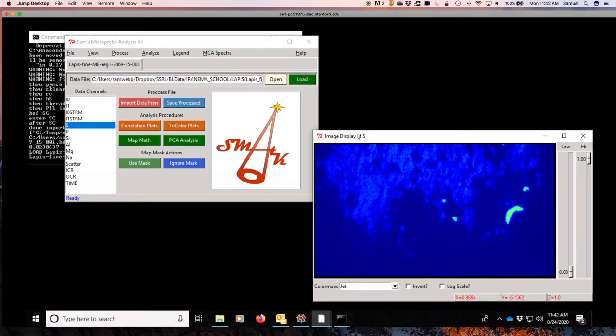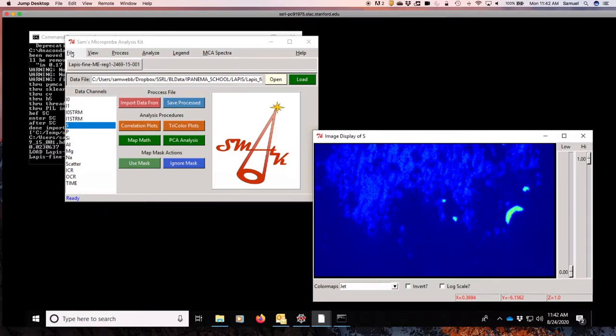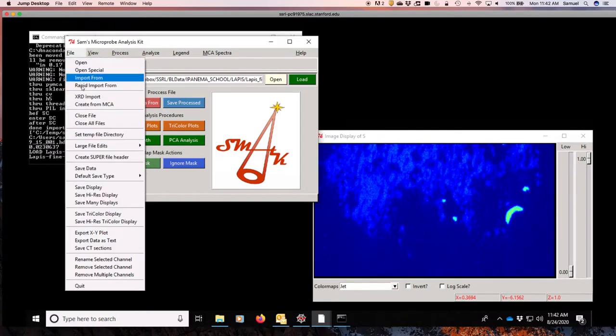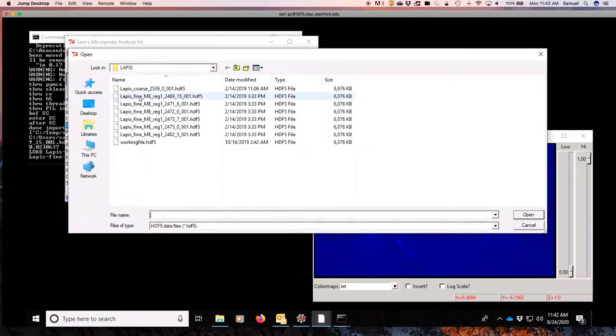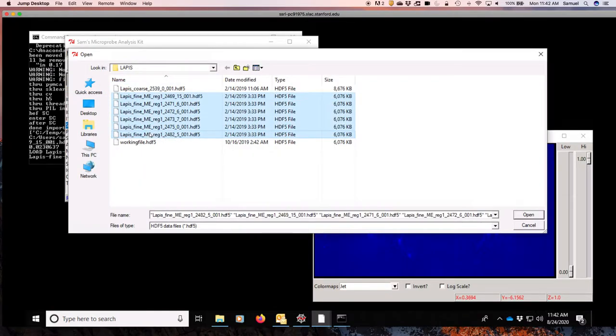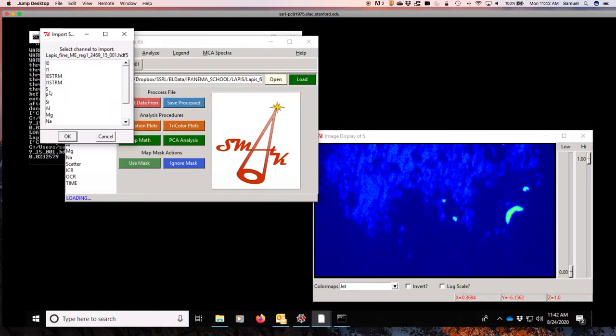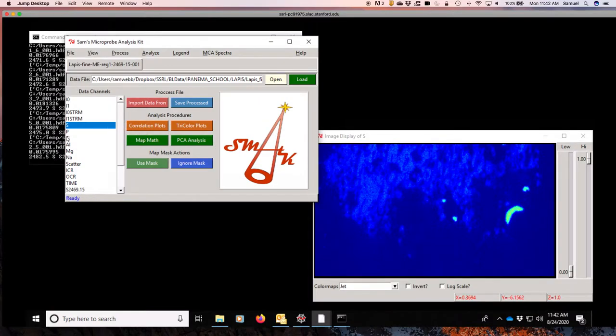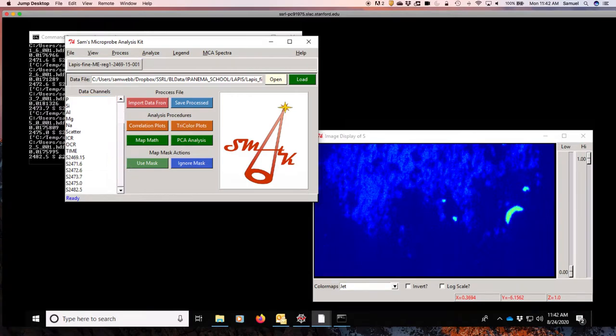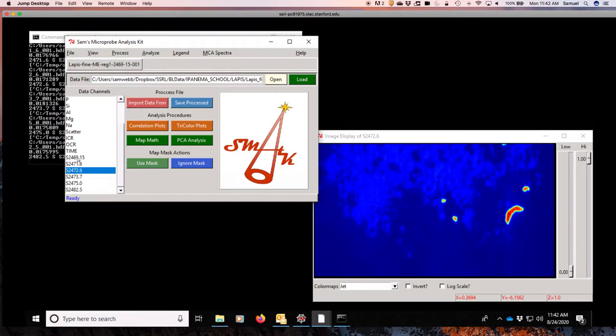The next thing we need to do now is to load all of the other data files into the data set. We are going to go to file and rapid import from. We're going to select the rest of our data sets. Open them all up, and we are going to import the sulfur channel from each of these data sets. And now we can come to the bottom. We've appended the energy to all of those, and we can step through and see the data.